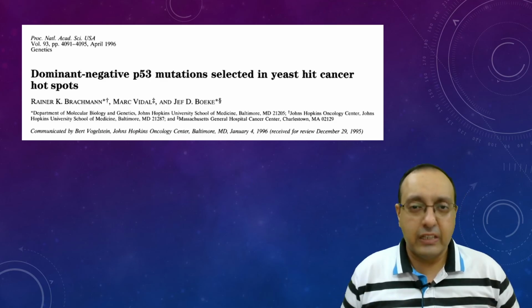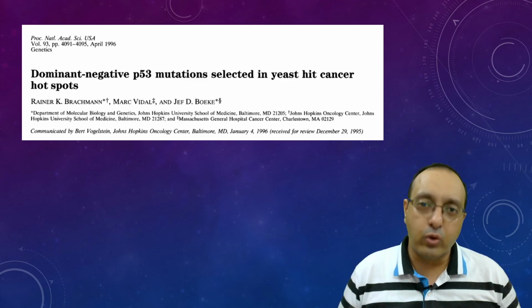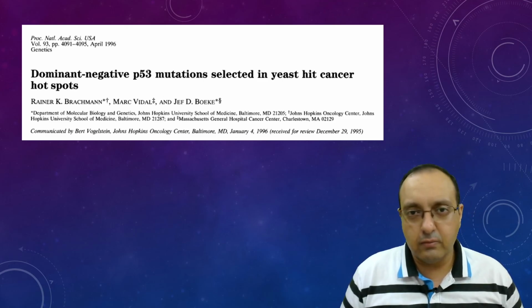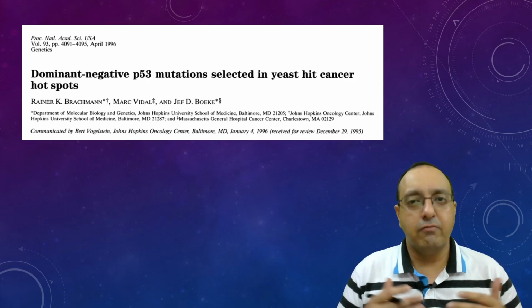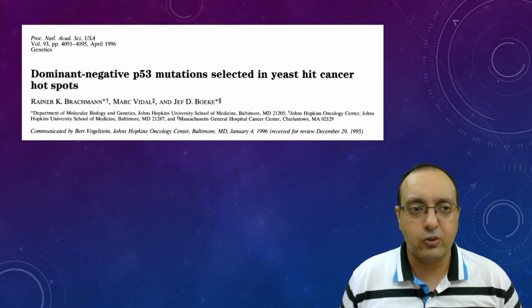So this was my discussion of the Yeast Two-Hybrid system. To summarize, it's a very powerful technique for screening protein-protein, protein-DNA, protein-RNA and protein-ligand interactions. It is very easy to set up and very easy to execute in the lab. It is widely applicable to any system, any model organism that you can think of.